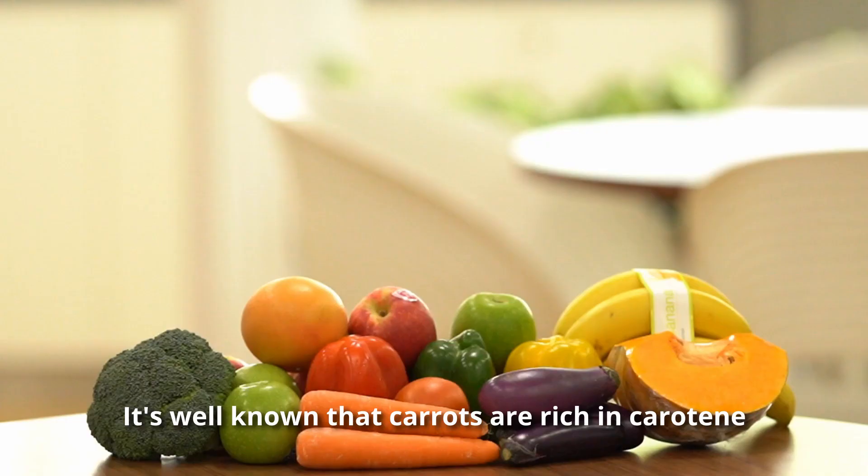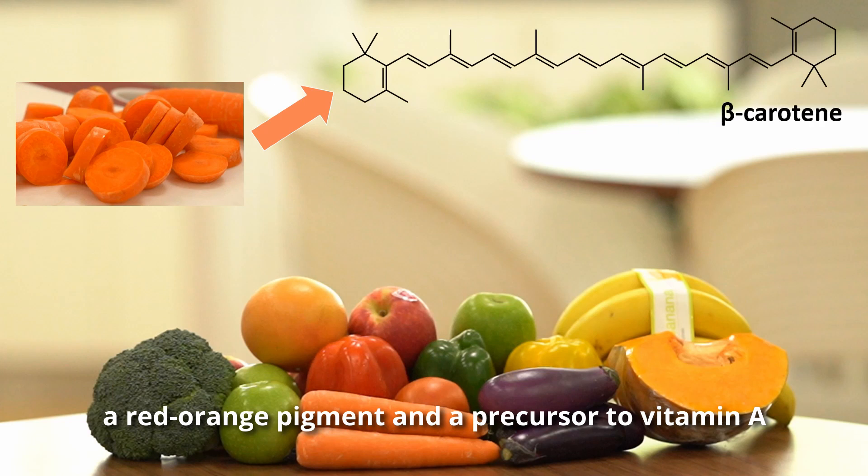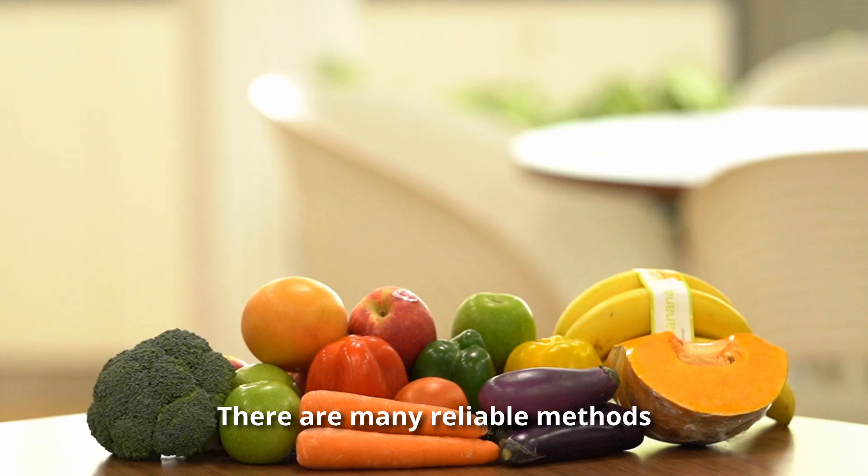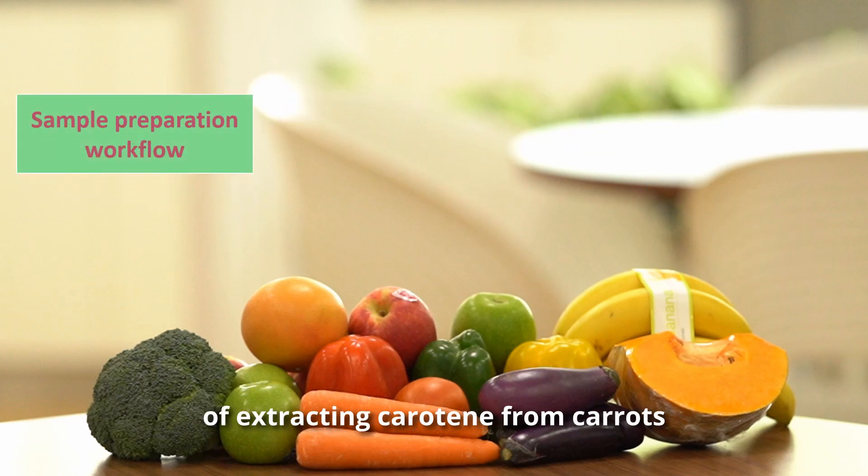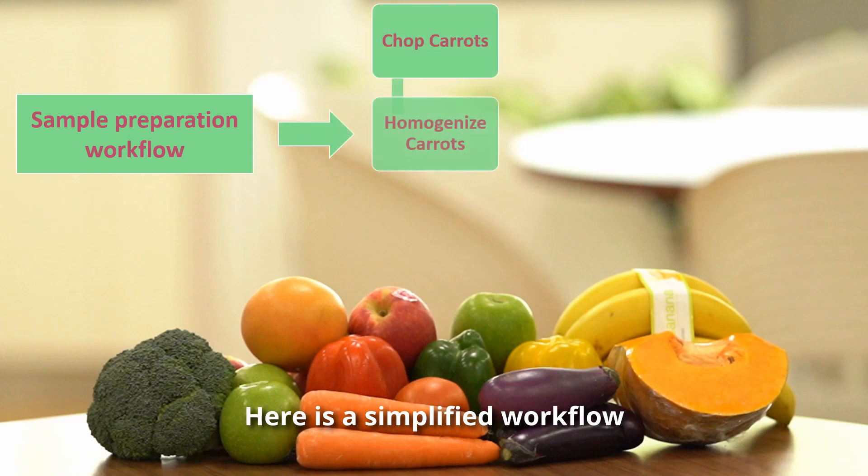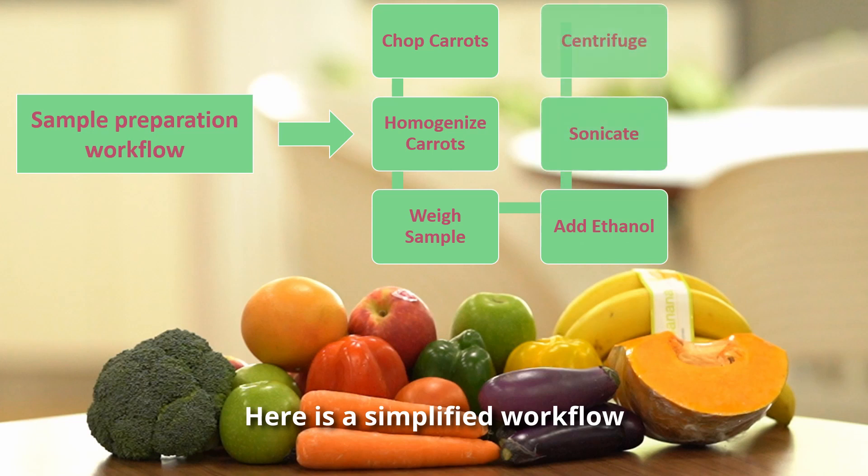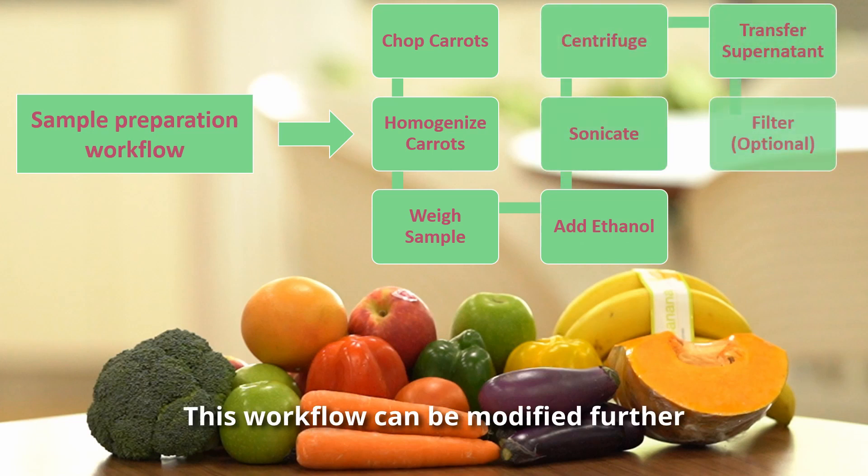It's well known that carrots are rich in carotene, a red-orange pigment and a precursor to vitamin A. There are many reliable methods of extracting carotene from carrots. Here is a simplified workflow. This workflow can be modified further.